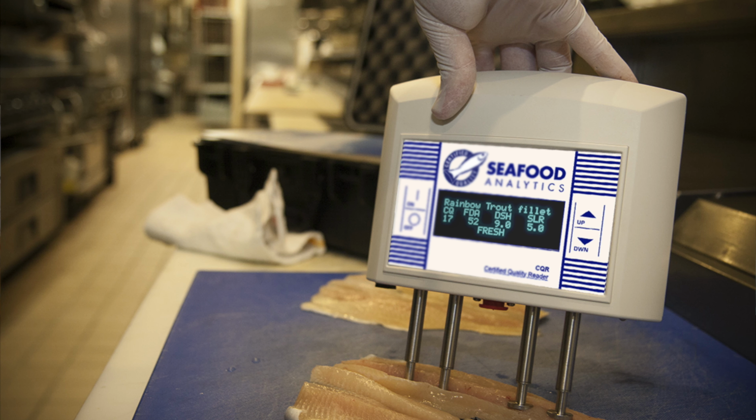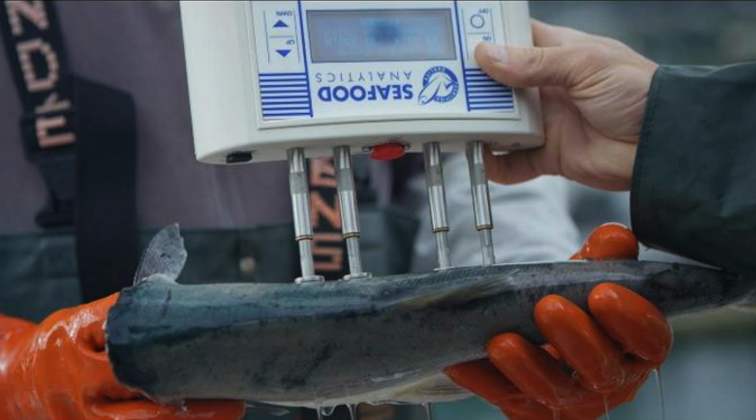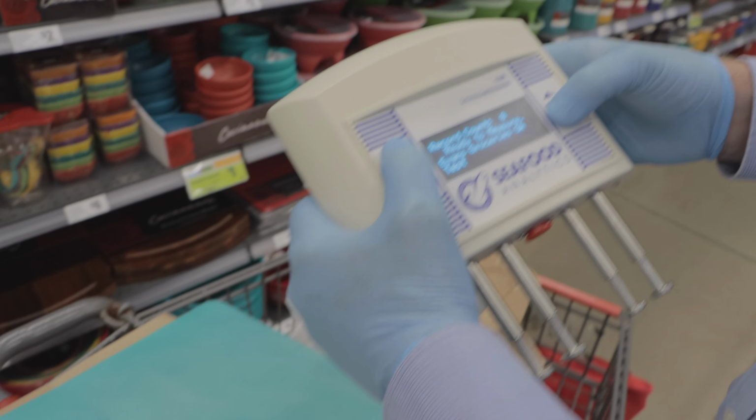So, one of the tools is a thermometer to say, well, what's the temperature? I want that fish to be under 41 degrees for the food code. And some people have tighter standards. Some people say, hey, if it's not under 38, I've got an issue and I'm going to talk to my supplier or I may reject the product. But the CQR would be reflective of any past abuses that product has had, because once damage in the tissue happens, it would be reading it up to that point.